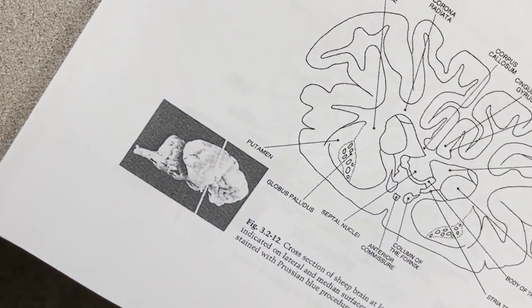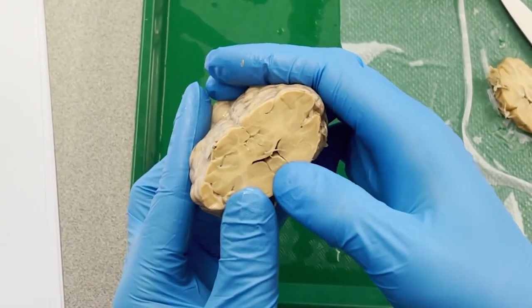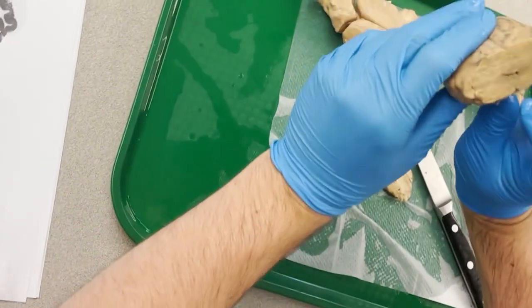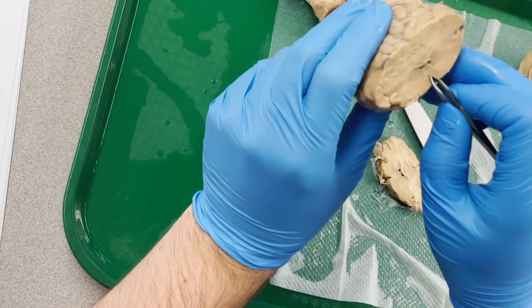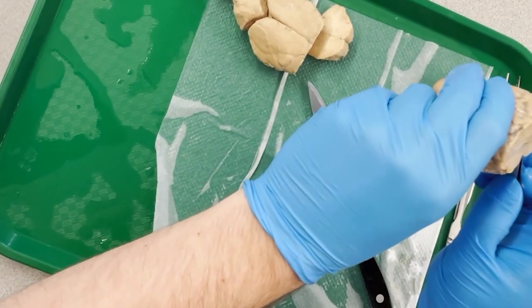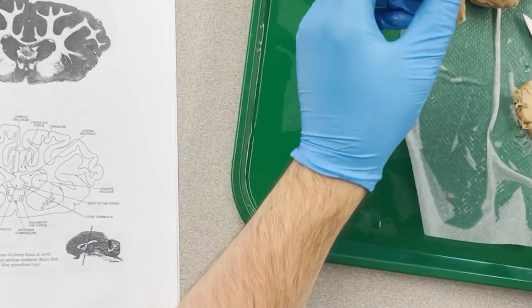There's a little dot in the center where it says anterior commissure, and on this specimen, I can actually see it. It's a bit faint, but you can see the slightly lighter colored area here where my thumbnail is, and you can take a closer look as you go along. So I'll just point to it with tiny forceps right here. Very faint, lighter colored spot there, right in the middle. That is a fiber tract within the subcortical areas that connects the two hemispheres at the bottom.